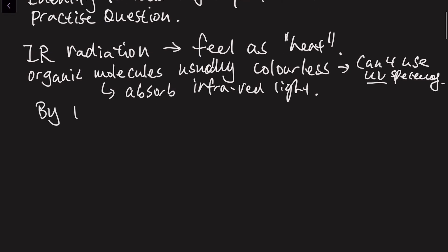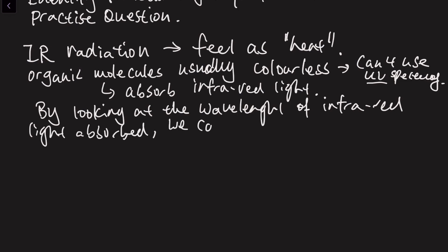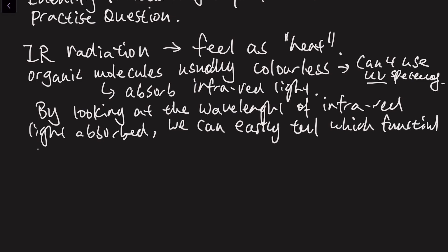So because of this, by looking at the wavelengths of infrared light absorbed, we can easily tell which functional group is present.